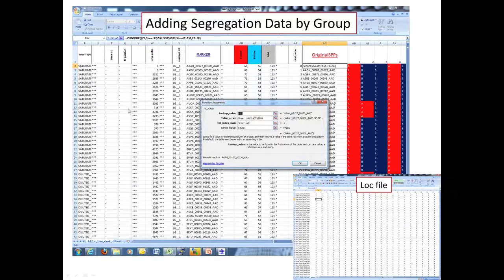All I've done is slide the cluster file over, and now I see this part. These are the markers. These are all in linkage group 1. So we've added linkage group 1. We just added this column here in Excel, by putting LG1 and filling it down to where the breakpoint was for linkage group 1. And here are the markers.